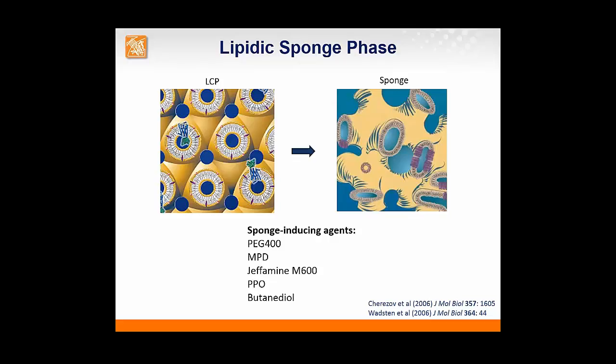You might get an aggregated protein which still shows diffusion in these assays. It might be possible to distinguish between diffusion of single protein and oligomeric aggregates by looking at the very fast part of the diffusion, but that requires optimization of these assays, and it's not yet implemented in the current version of the LCP FRAP instrument.